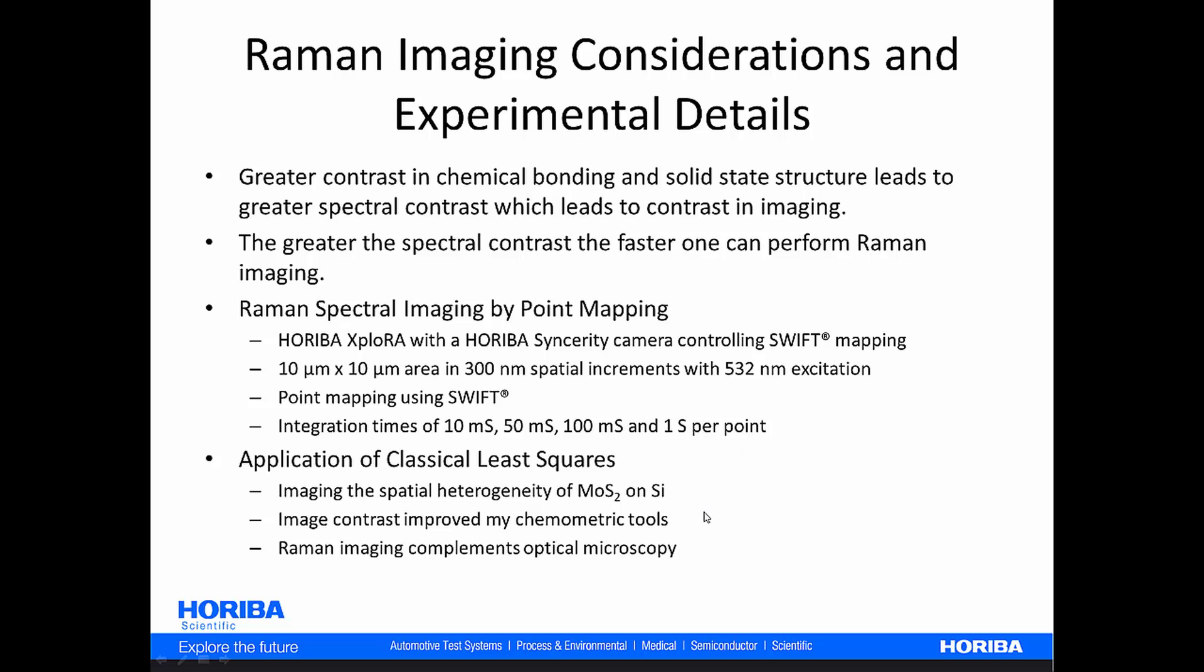And finally, we'll show you how the application of a classical least squares algorithm, and there are other chemometric tools, can really help you in imaging, particularly fast Raman imaging. Here, in this session, we're imaging the spatial heterogeneity of molybdenum disulfide flakes on a silicon substrate. And our image contrast is improved by the chemometric tools. And what I hope you'll see is that the Raman imaging is quite complementary to the optical microscopy that you see.